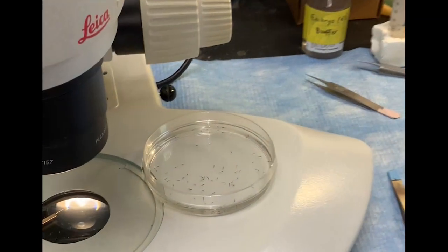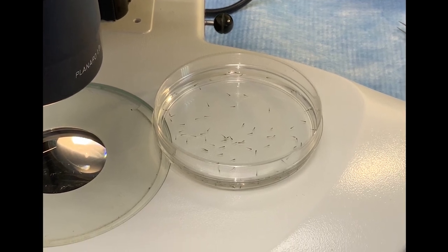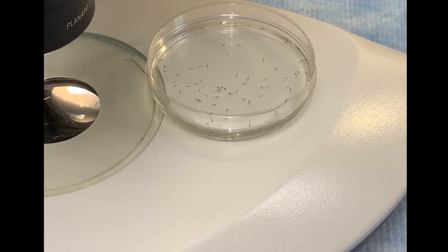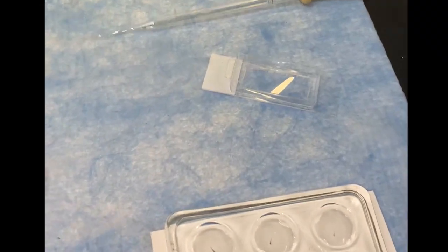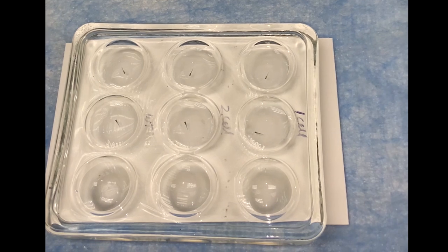While calcium imaging is widely employed in model organisms as diverse as C. elegans and primates, our lab uses it to study neural network assembly in developing zebrafish larvae. The advantages of zebrafish are that the larvae are small, transparent, and develop rapidly. It is possible to image the entire brain, or nearly the entire brain, while providing well-defined sensory stimuli to the larva.